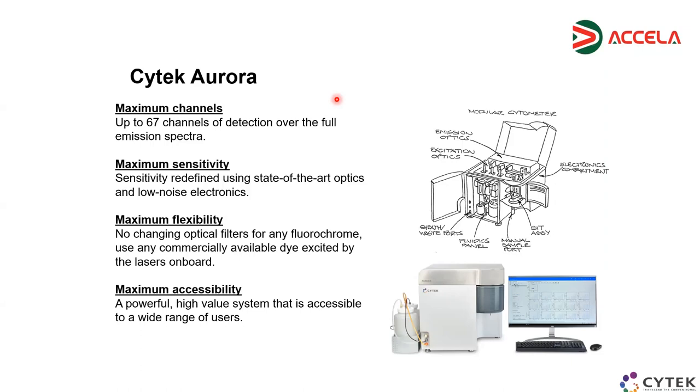And I think that with Cytek Aurora, we can also provide a half-year or 1-year license to test FCS Express, because there is a spectral module in FCS Express. Another story is multiparametric analysis. As you remember, I showed this viSNE plot using 40 colors, 40 antibodies. These are separate software which work in the cloud. We cooperate with this company, OmniCyte, which produces this multiparametric plot. And we always, of course, inform the client, depending on the number of colors they want to do, which is the recommended way to process the data. These are FCS files which can be opened by any flow cytometry software.